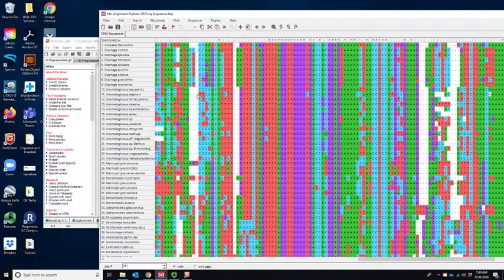And before we jump in and look at analyzing this data set, what I'd like to do is just talk a little bit about file format. You experienced a little of this, some of you did, on the first project because Mega saves it in their own file format. It's a .mas extension, and that can only be opened with a Mega program. It works well for that program, but there are other file formats that are more universally used that pretty much any program can open, and I'm going to look at two of them, and we'll just deal with the second one, the .fas, or what's called a FASTA or FASTA format.